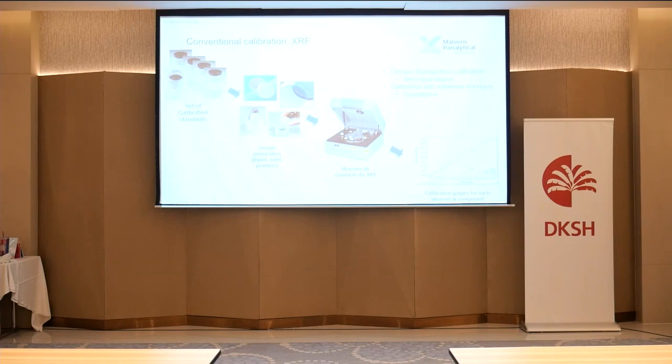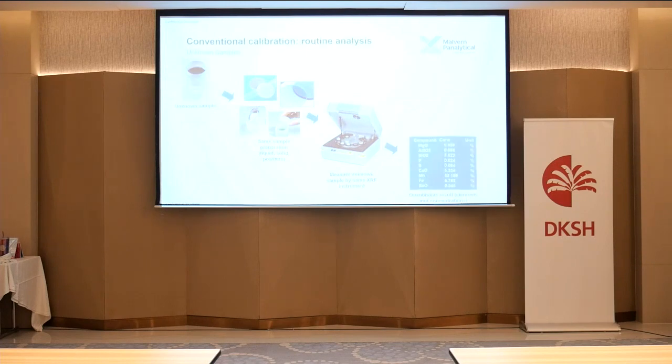Because we have our own accredited lab, which can make the certified reference materials to calibrate the XRF, just like ICP, you can calibrate the XRF, and we provide these standards. So you have the set of standards. You prepare the sample in one of these ways, put it onto the XRF, and then you draw this calibration curve. And once you have this calibration curve, then you can measure any of your unknown sample.